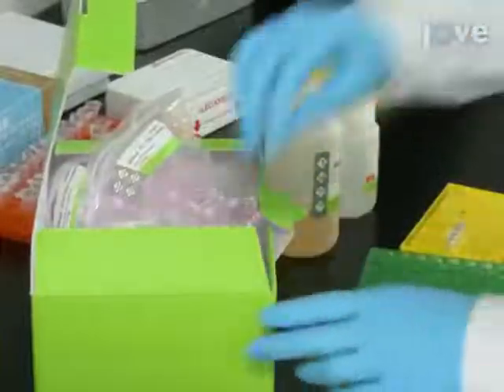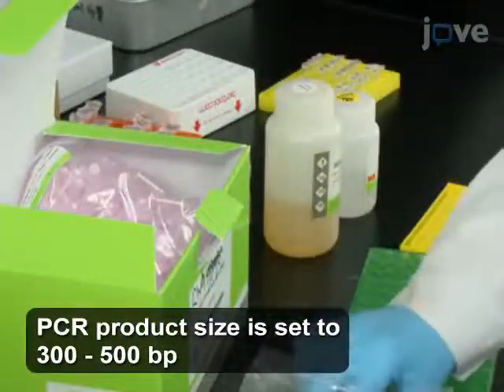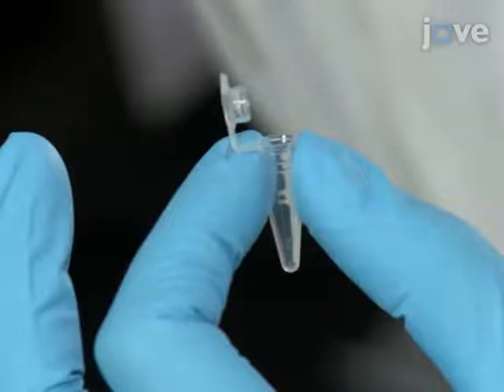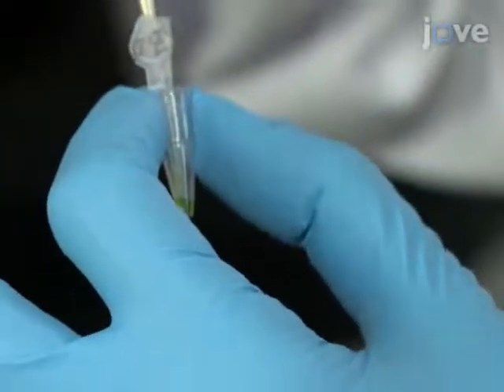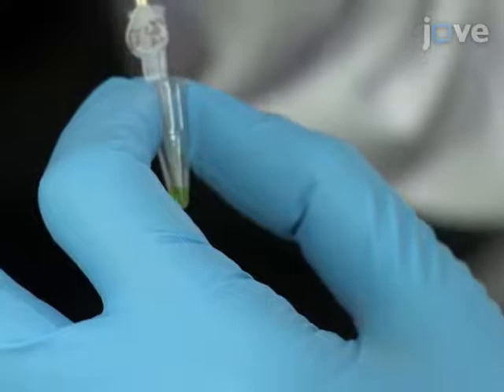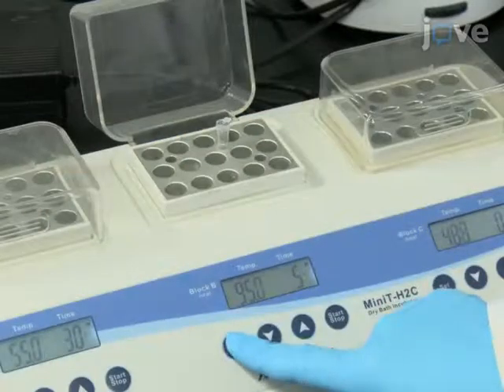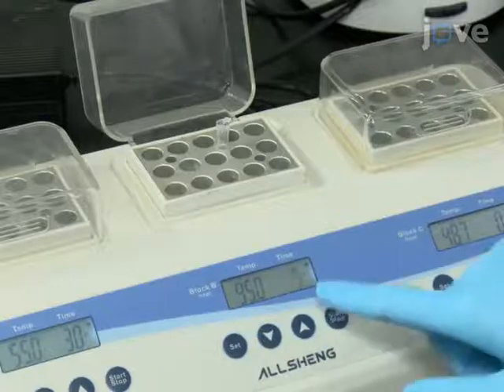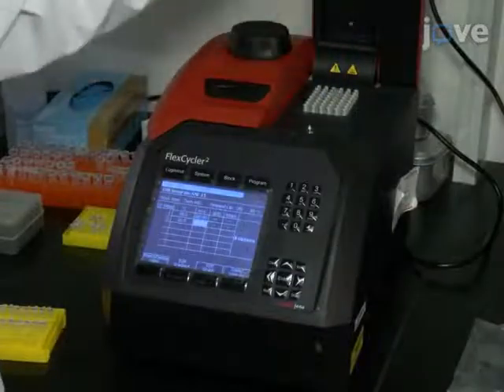Amplify the sample by nested PCR using the manufacturer's protocol. Mix 1 microliter of the lysis product with DNA polymerase and a pair of outer primers recognizing the sequence around the sgRNA target site, and perform the primary PCR in a total volume of 20 microliters. Next, activate DNA polymerase at 95 degrees Celsius for 5 minutes. Then perform the primary PCR with a final extension at 72 degrees Celsius for 5 minutes.